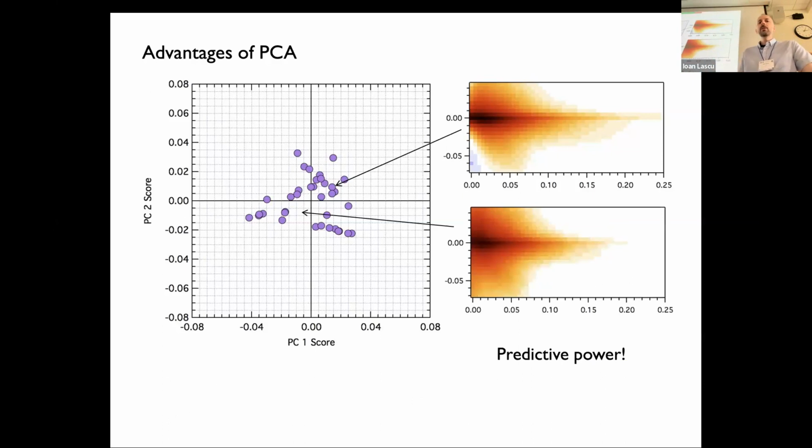And so as we'll see, and as we'll explore this unmixing space with the cursor in FORCinel, you can move around the unmixing space, and at every point you'll have an instantaneous reproduction of what the FORC diagram looks like. So in areas where you don't have a lot of data, you can sort of predict what some of these FORC diagrams might look like.